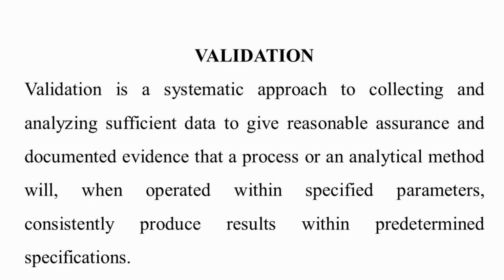In validation activity we check more than one parameter. Validation studies are done by considering good and worst conditions. Validation study results are collected, processed and act as evidence. All the evidence helps to show that the instrument, method, or process is able to produce consistent results within specific conditions.